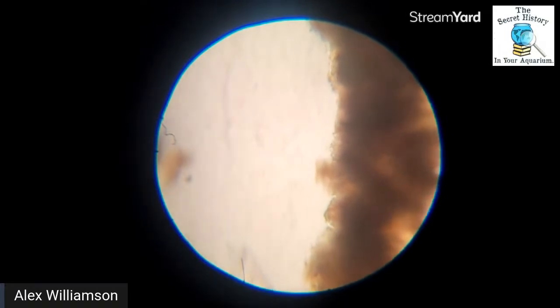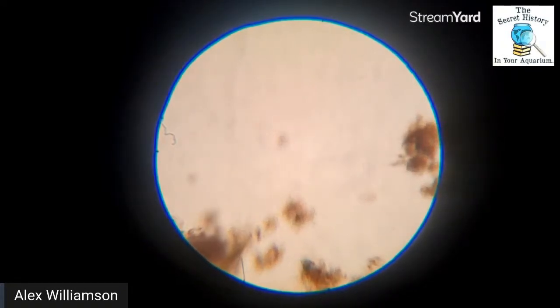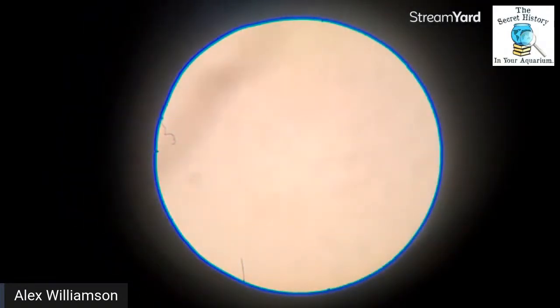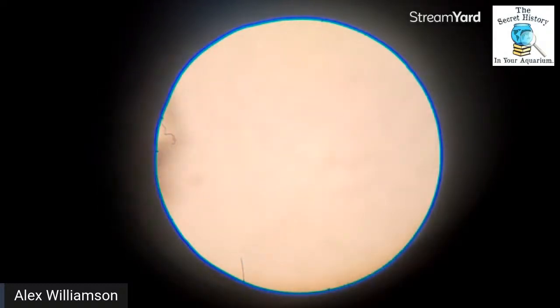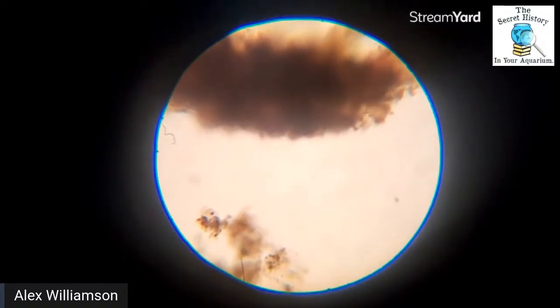And let's see what we can see. Anything at 40 times zoom? What amazes me, though, is how often when you go down into the mulm, it's not dirty like you would think. It's not full of little creatures. It's right above that, and it's live leaves and things, not the dirty brown mush that is full of things. I mean, there's lots of bacteria and fungi breaking things down.